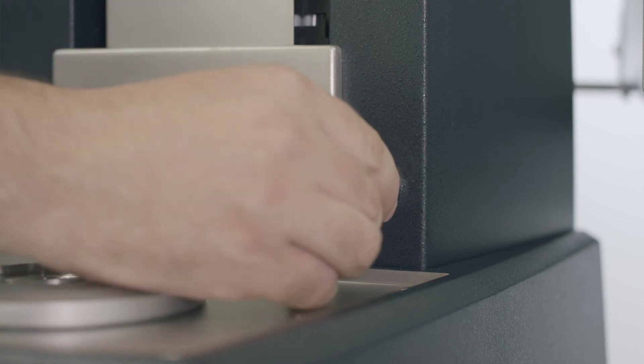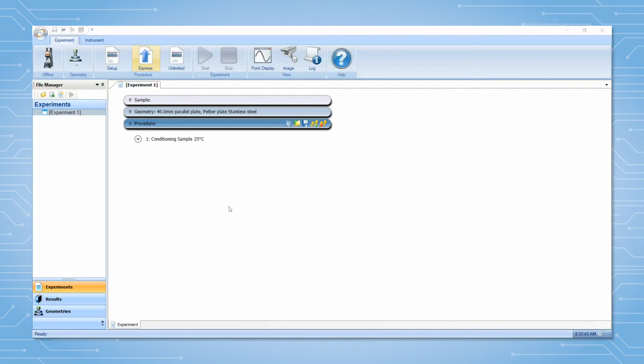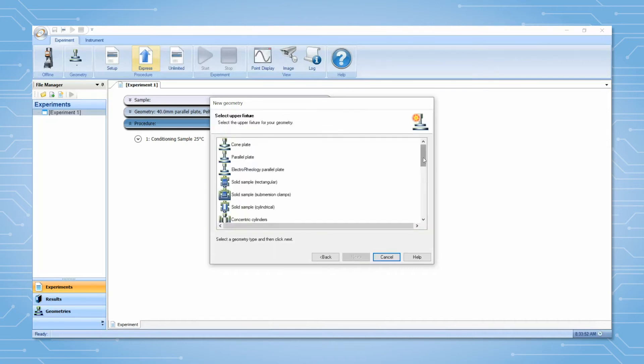Install the smart swap plug. If the geometry is not already set up in TRIOS, select Add New Geometry, Next, Extensional Fixture.